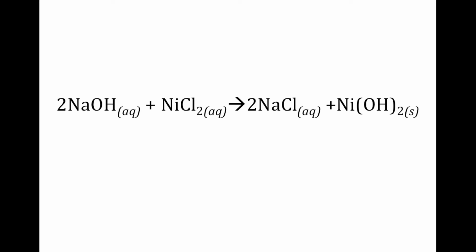The three different types of double displacement reactions are precipitation reactions, gas-forming reactions, and neutralization reactions. In this lab, we focused on precipitation-forming double displacement reactions and demonstrated how we can predict reactions by establishing a balanced equation of the reaction, always using the solubility rules as a guide to identify the compound's phases.